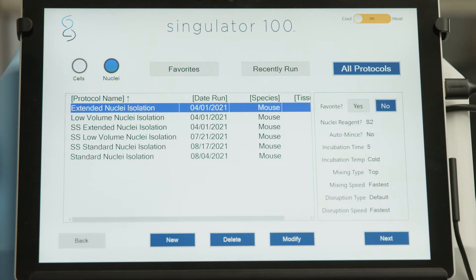Select the option for nuclei isolations. Select the All Protocols tab to view all of the available protocols or select from Favorites or Recently Run.